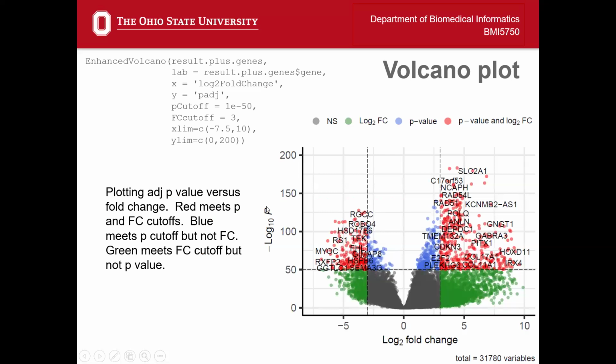It's usually the FDR value, but the name just says p. This means that very small p-values have a very large number because we are logging them. So the larger this number, the more significant our gene.